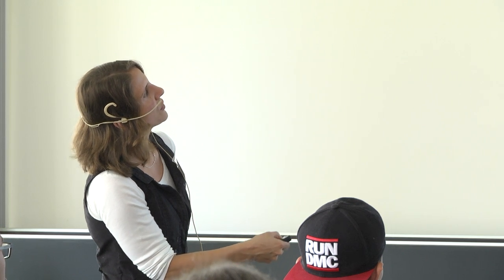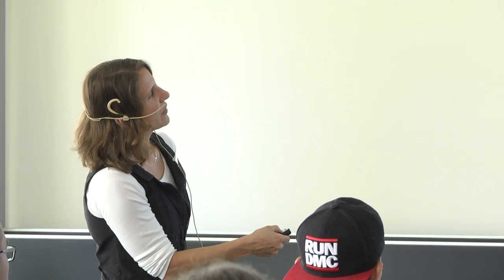And in this little example, you see, for example, that this blue transition is clearly shifted in retention time from these other 3 transitions. So this blue transition is clearly what we call interfered. There's another analyte, another peptide or contaminant in the sample that induces this blue transition. And this is why for accurate quantification, you would like to delete this blue transition and rely your quantification on the other 3.